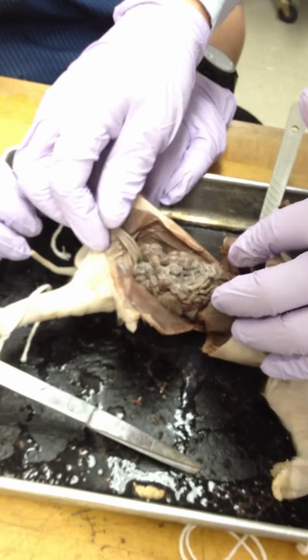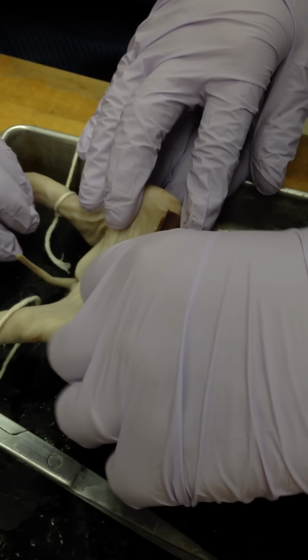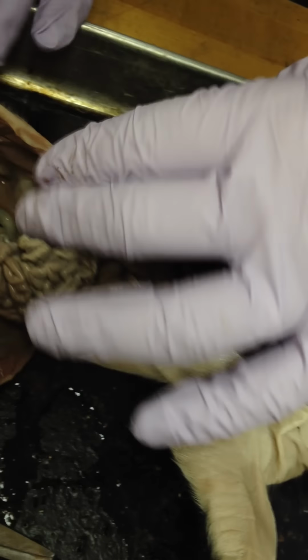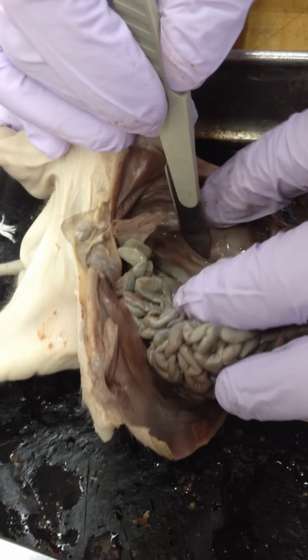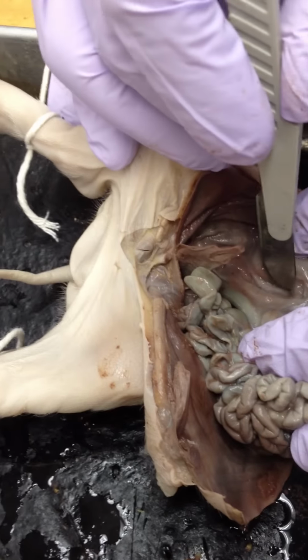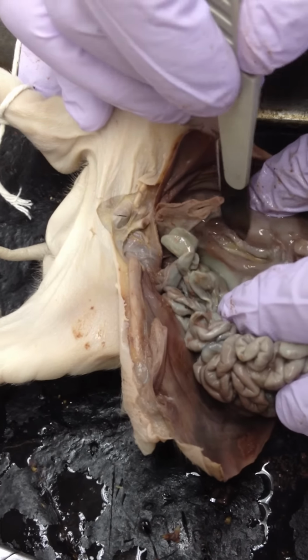And anything else that I can think of? I really hope to show the kidney and the ureters, if we could. Oh, there's a kidney there. The ureter and bladder may be a little harder, but they should be there too. Oh, this is so gross. Okay, oh, there he is.